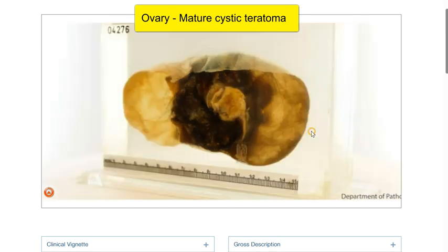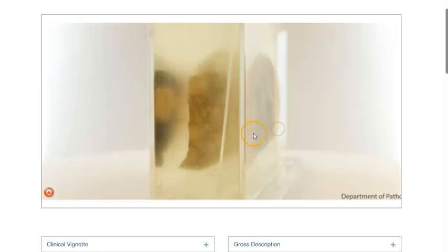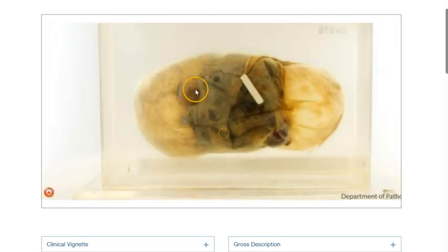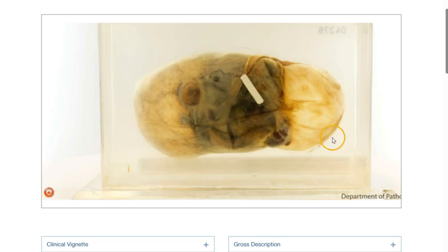Let me just turn this around. This is the capsular surface, and the capsular surface appears to be intact. There is no evidence of rupture here.